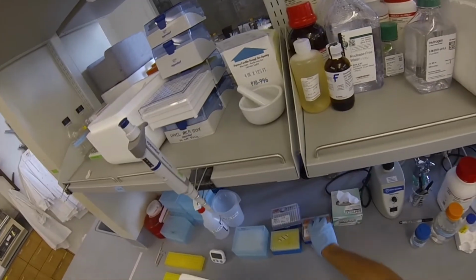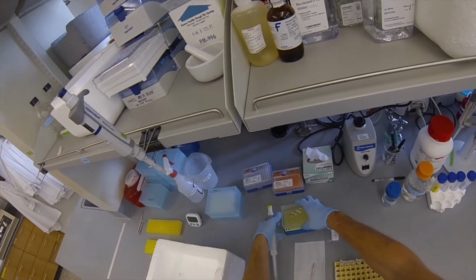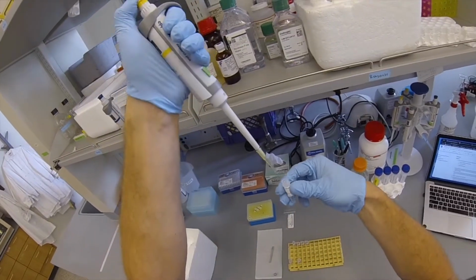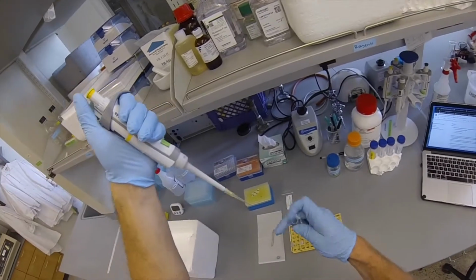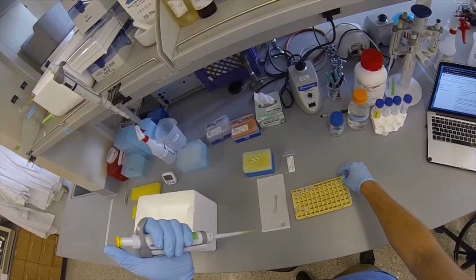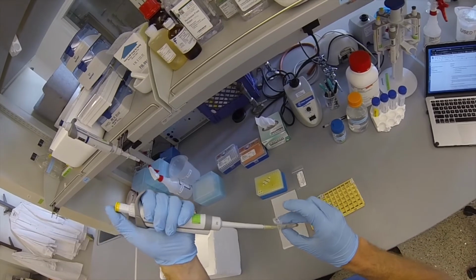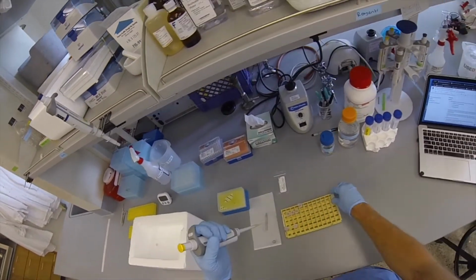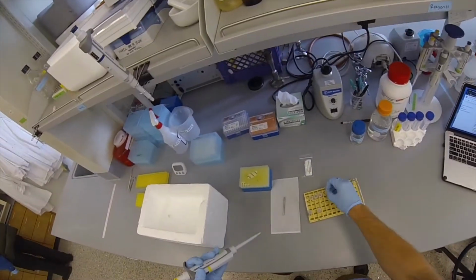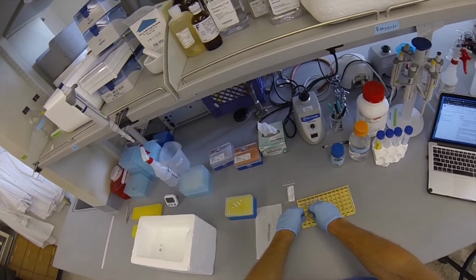Finally, you're going to add 20 microliters of proteinase K to each sample. You're going to use one pipette tip per sample, inserting deeply into the sample and then pipetting all of the proteinase K out. Make sure to put the proteinase K back on ice once you're done using it.